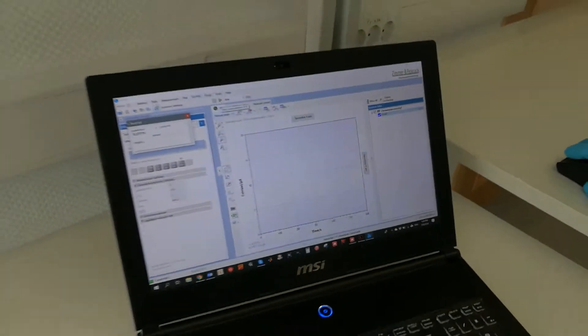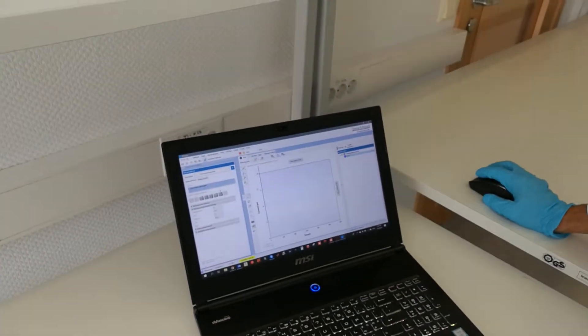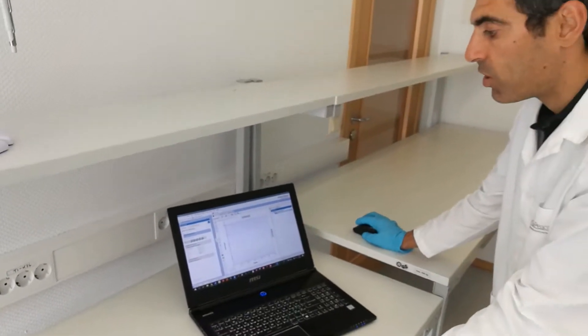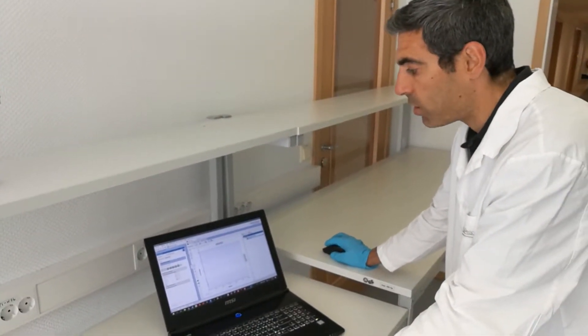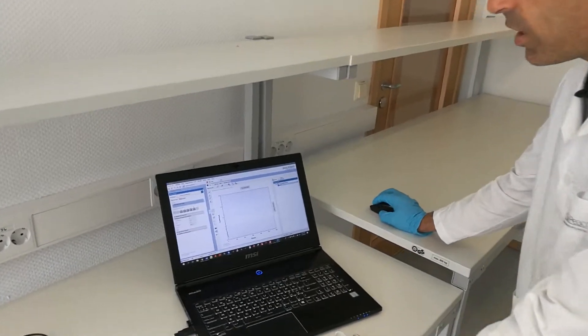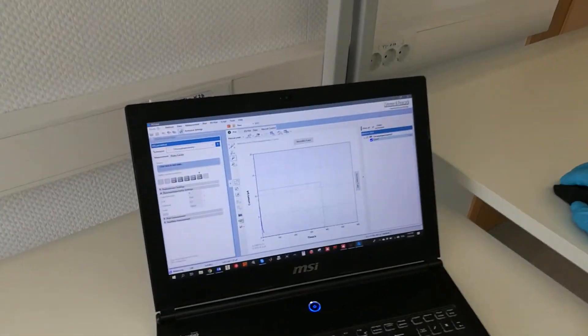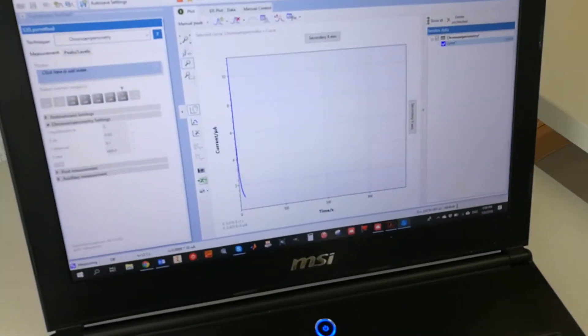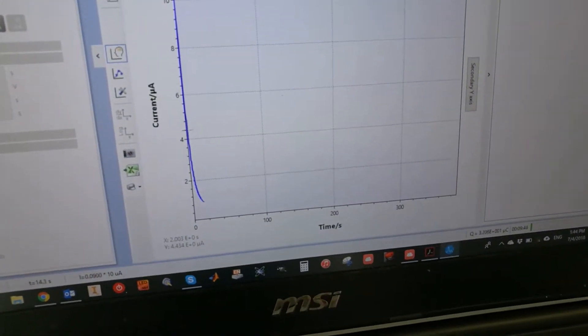So I'm going to start running this measurement. Since it's an amperometric measurement, you'll see a drop in the current measurement to close to zero for the calibration stage.